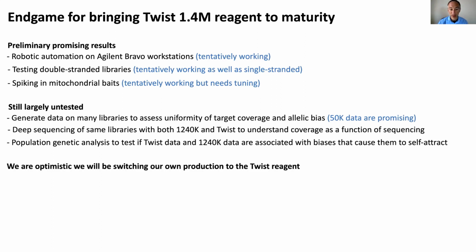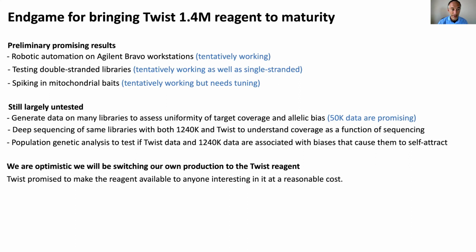We're optimistic that we'll be switching our own production to the Twist reagent. Twist promised to make the reagent available to anybody interested in using it at a reasonable cost, which we're very happy about.